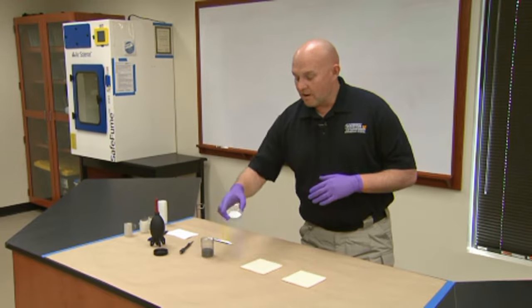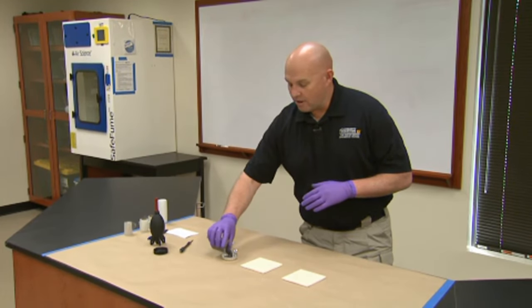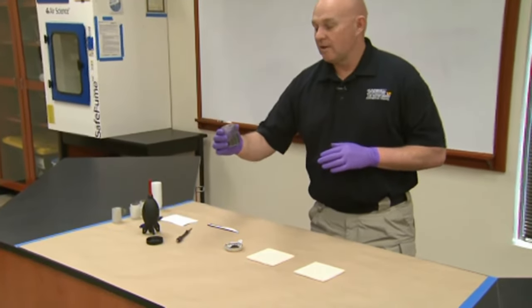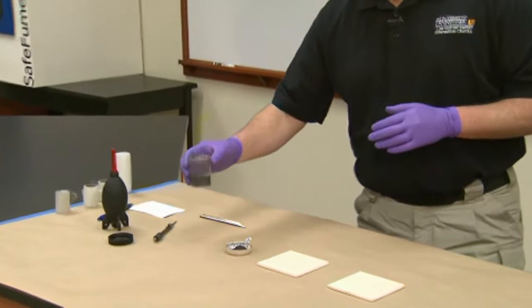What I typically carry around with me is just one of these trays. You can put magnetic powder in it. Just make sure that the magnetic powder you start with is clean and hasn't been used in other places.